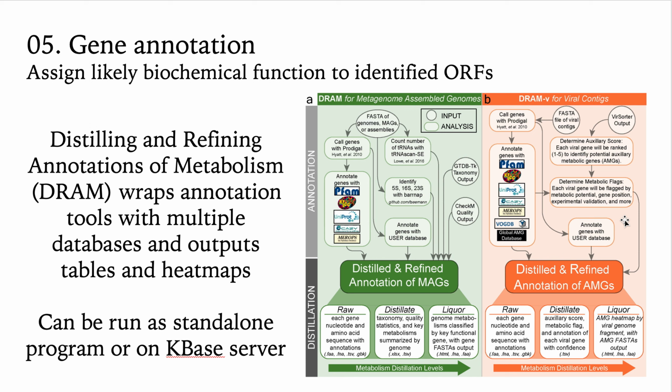And I've had some really good experiences with DRAM and look forward to using it more. The one caveat is I'm not sure it can be used on shotgun metagenomes right now. I used it for genomes, and so I'd have to take a look and see if you could input an entire set of metagenomic contigs.